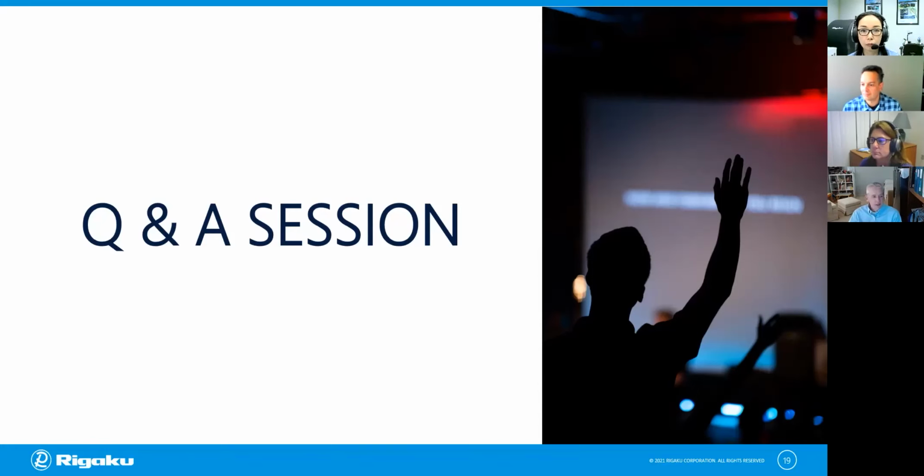May I add something? All of that I just described is available in Dragonfly today. Something we're doing right now, I think done last week in the lab, was adding new measurement codes for the objects that you're measuring, such as spherical harmonics coefficients, that would give you a high degree of characterization of your particles, whether they're voids or grains or anything else.